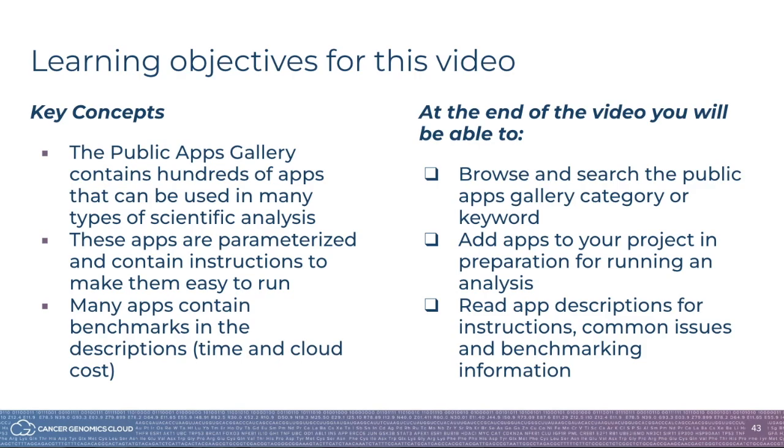At the end of the video, you will be able to do the following: browse and search the Public Apps Gallery by category or keyword, add apps to your project in preparation for running an analysis, and lastly, be able to read app descriptions for instructions to common issues and benchmarking information.